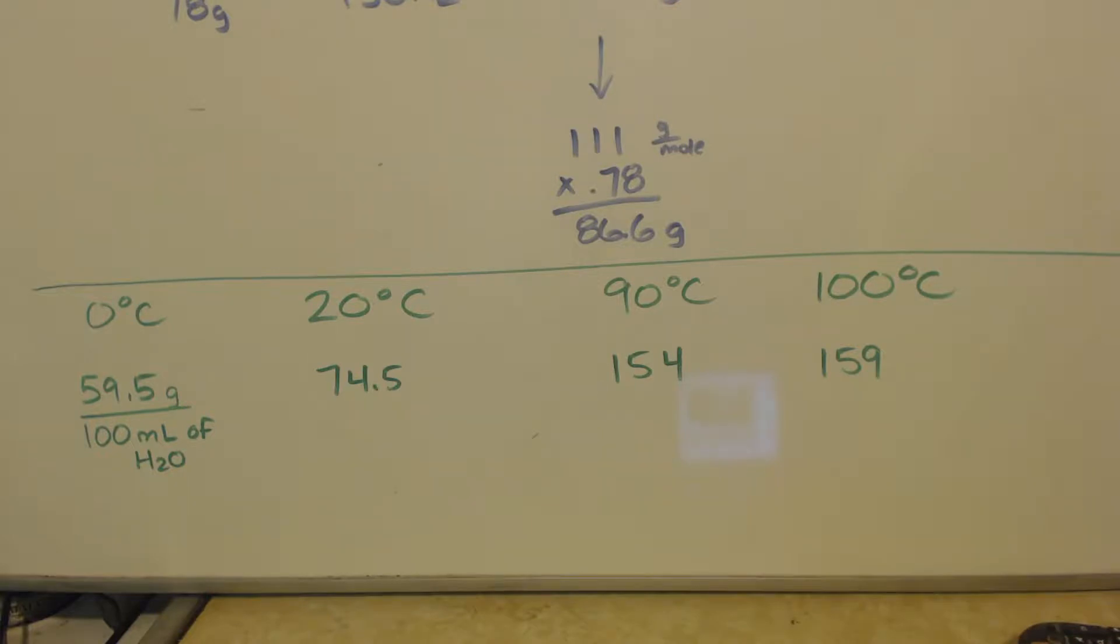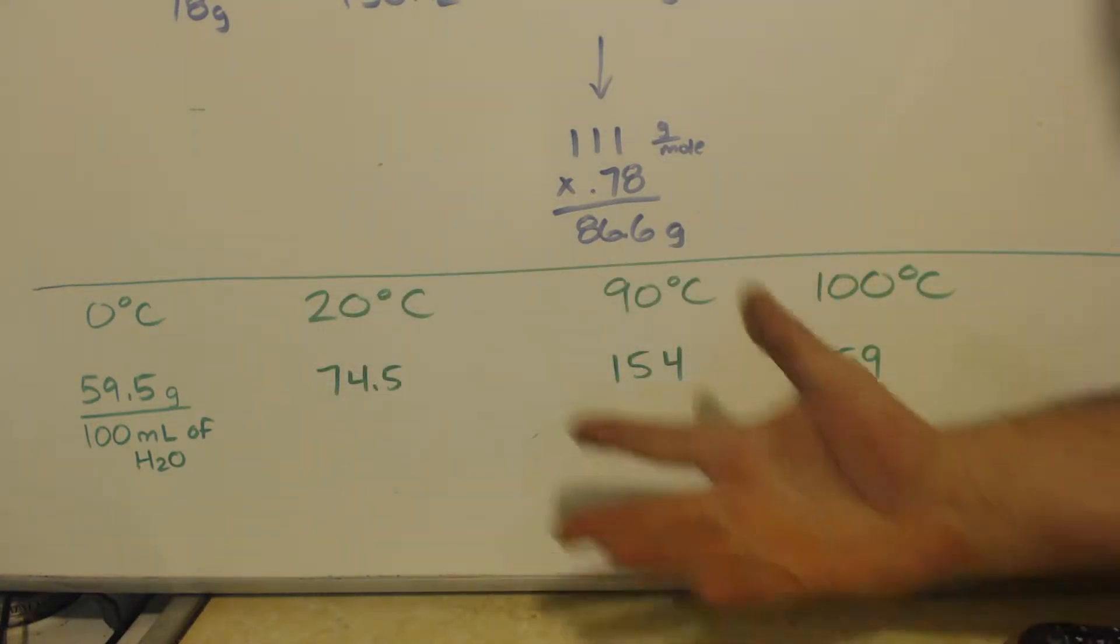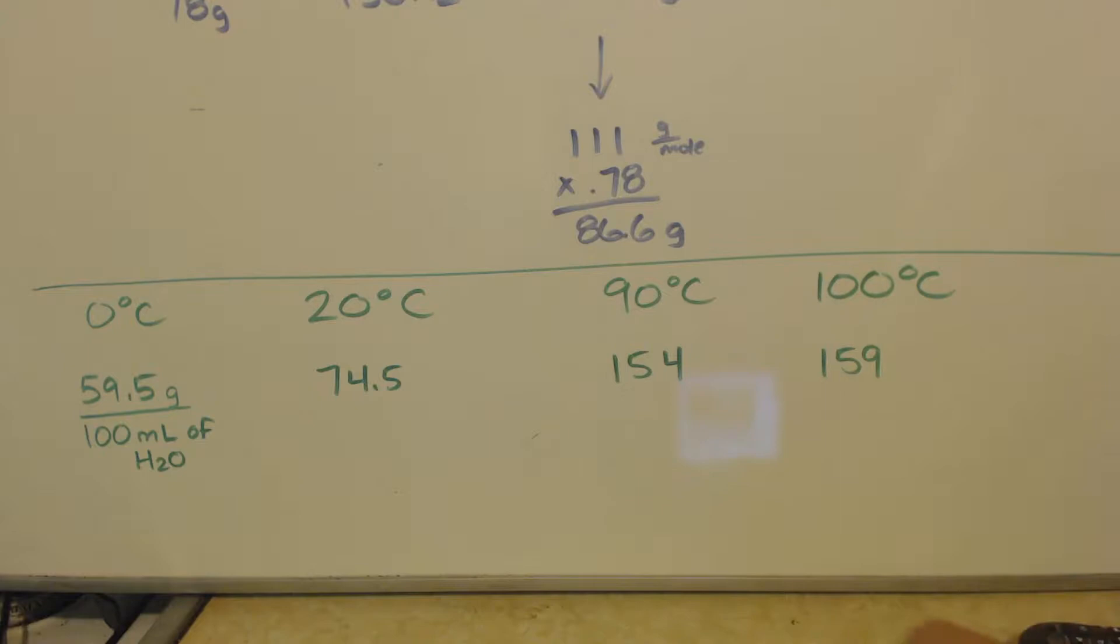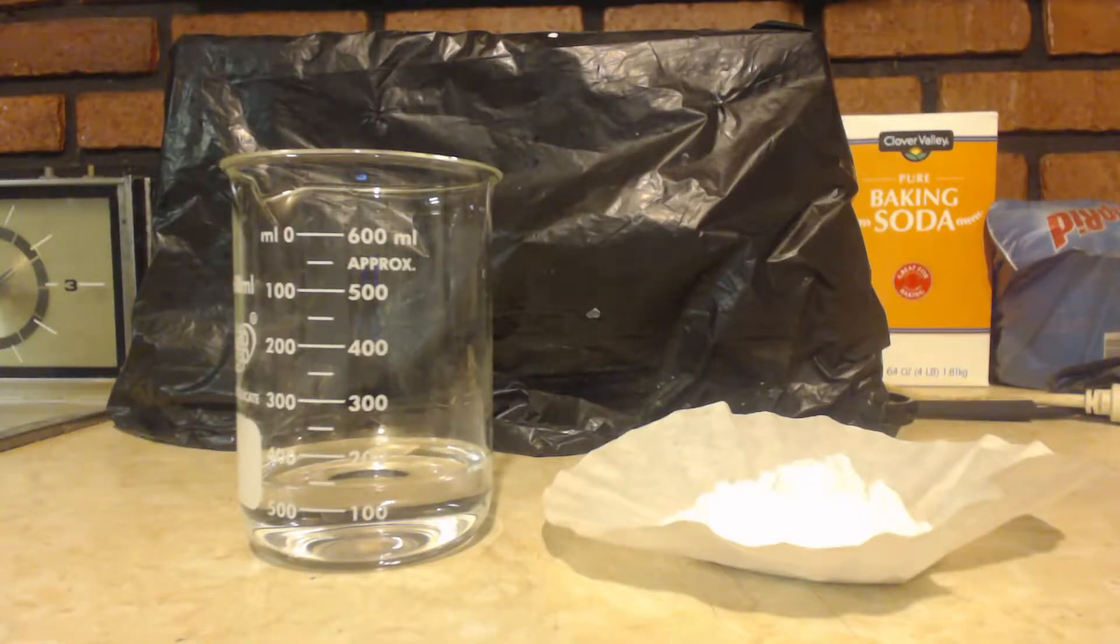If you recrystallize this from water, 59 grams will stay in solution and 100 grams will precipitate out, which is about two-thirds. After normal recrystallization, as soon as it starts crystallizing you take it off the heat. I'm gonna keep heating it up and get rid of a lot more water.